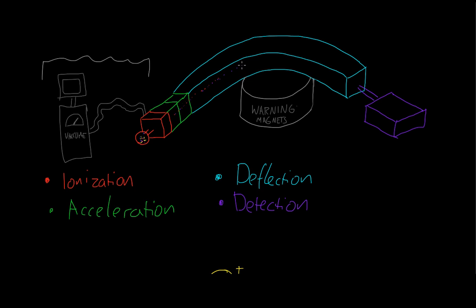So let's say the purple one is at the perfect thing to go first, the perfect mass to go first. So at an arbitrary strength of, let's say, 1, the purple beam of ions is detected. So we start hitting this and we can measure an electron flow on our computer here. So then we measure the voltage and we can assign that to the strength of the magnet.